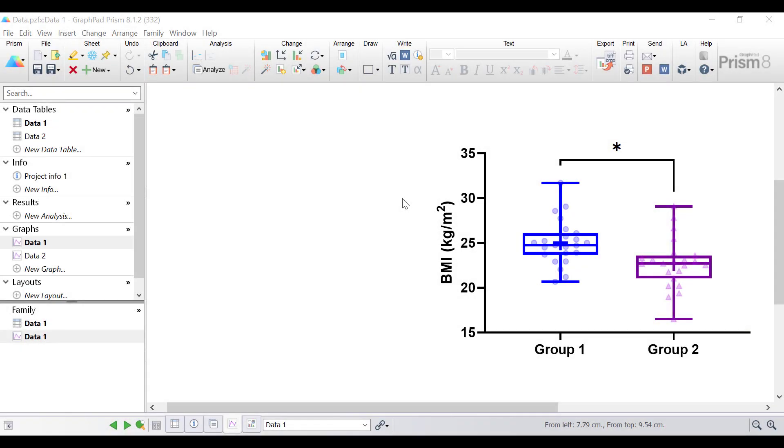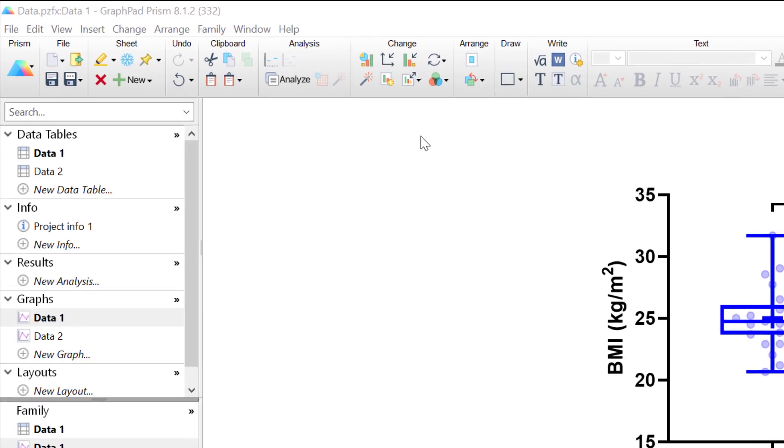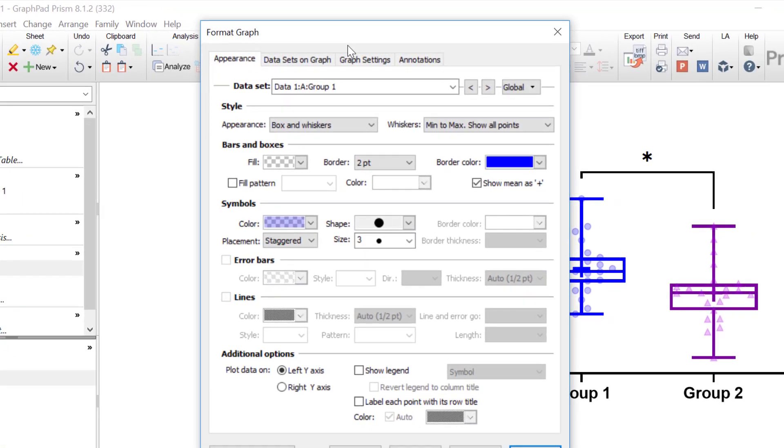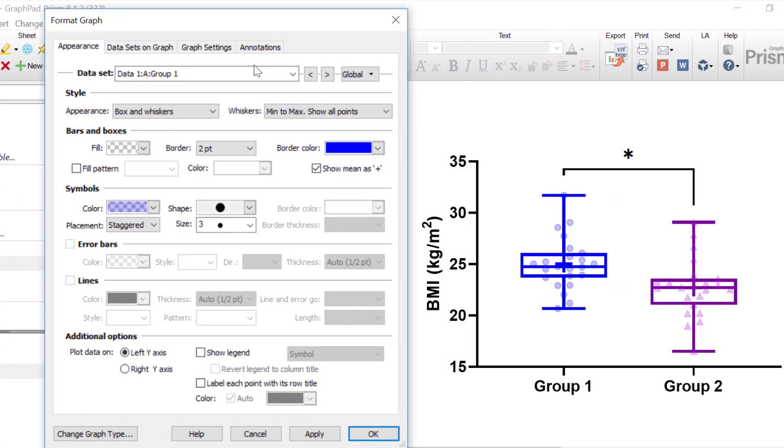Instead of changing the appearance of graphs by individual data set, it is also possible to change all of the data sets simultaneously. By going to the Format Graph button at the top, you can tweak the attributes of the graph, for example the color, the symbols and error bars.